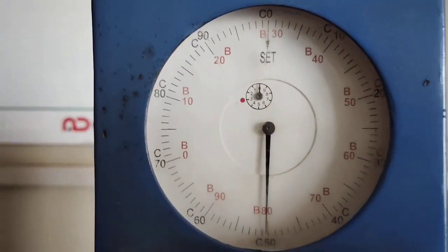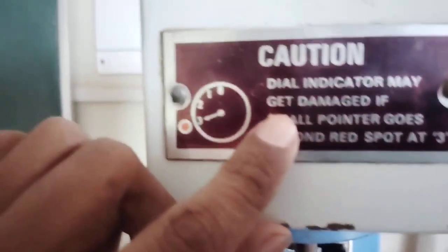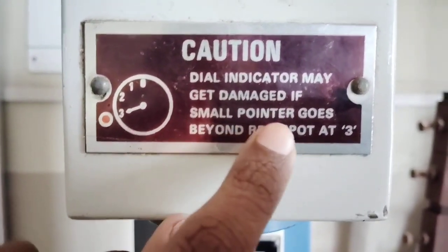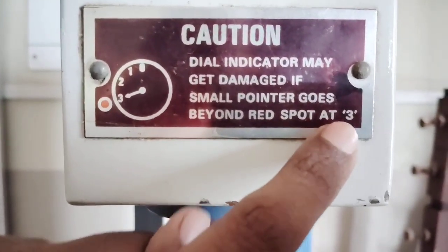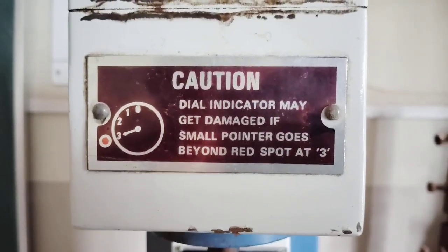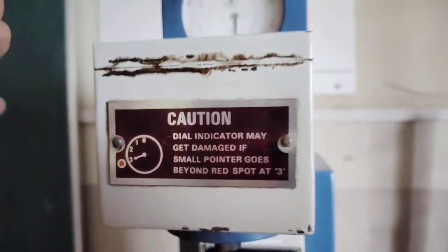As we move behind, we have an instruction saying that the dial indicator may get damaged if the small pointer goes beyond the red dot at 3. As I said, the minor load applied should not go greater than this value of 3.